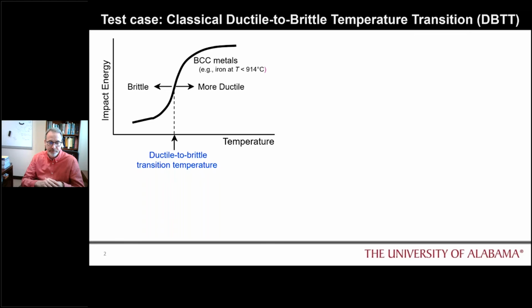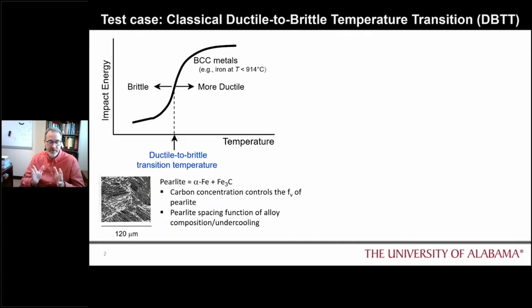With that in mind, we used a plasma FIB and a gallium FIB. In the upper left corner are some of the general parameters we used. We used 30 kV, 15 nanoamps of the xenon plasma FIB to rough cut out a micro cantilever beam, generically shown below in that schematic. Then we did some final polishing of that beam at 1 nanoamp. And then we used our gallium FIB to cut the actual notch that we would need. To the right in the middle, this is a schematic of the pearlite structure, denoted by the different laths, and we call lambda the spacing between those laths.